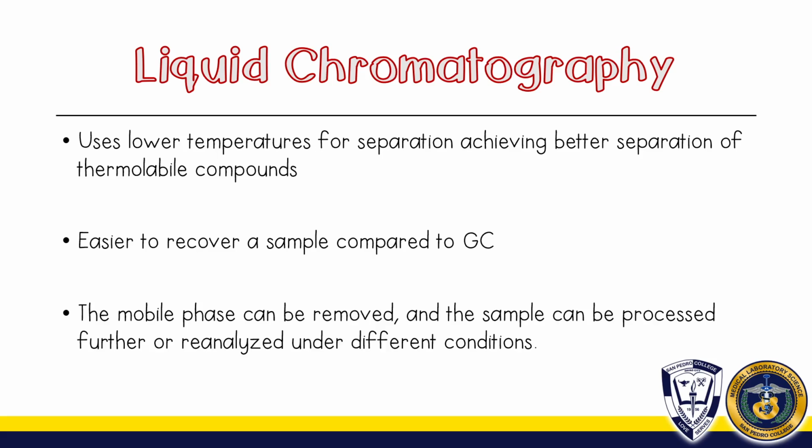Now, the mobile phase can be removed and the sample can be processed further or reanalyzed under different conditions. This is actually another advantage of your liquid chromatography over your gas chromatography, since your sample can be recovered, then further processing can be done.